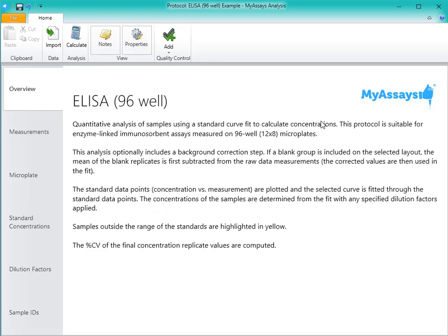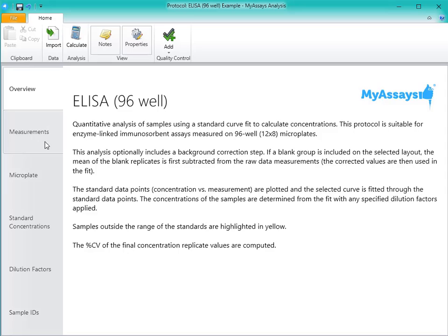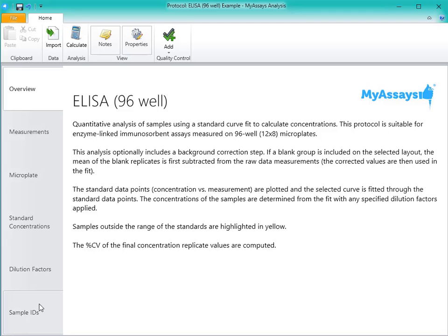Once the protocol is open, we can see on the left-hand side of the screen the various tabs that will allow us to configure our data, plate layout, add standard concentrations and dilution factors, and add our sample IDs.